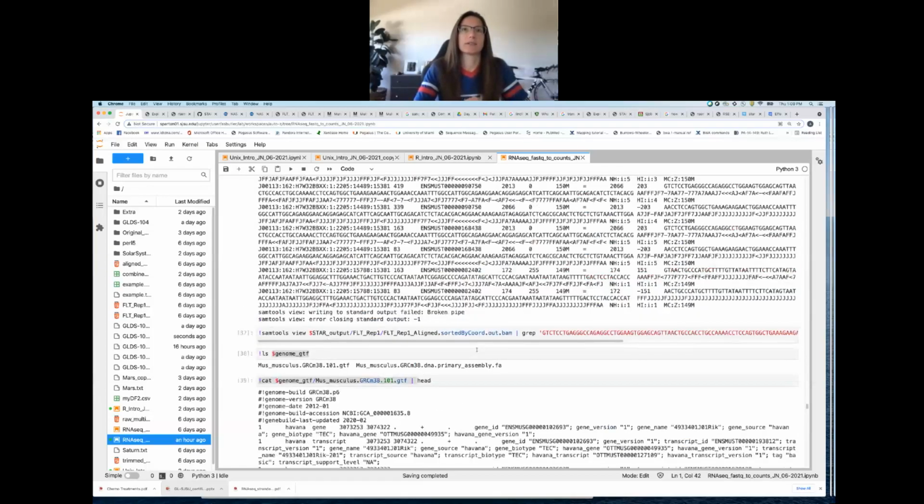Yeah, there's so much information in BAM files. There's a lot of things you could do, a lot of ways to play and troubleshoot and really get a grasp on just how your data is being analyzed. And I love how you're thinking about how these nuances and these settings that we put in the different tools can affect our outcome ultimately, and making sure that we're not introducing biases in our computation, or at least minimizing the number of biases that we're introducing as much as possible. So I love the way you're thinking.